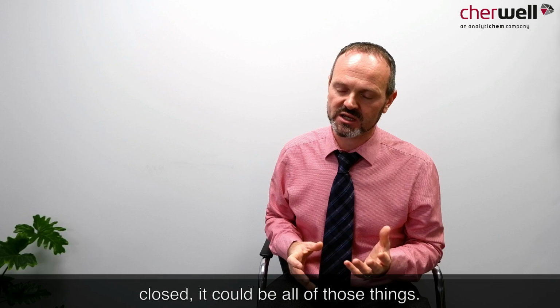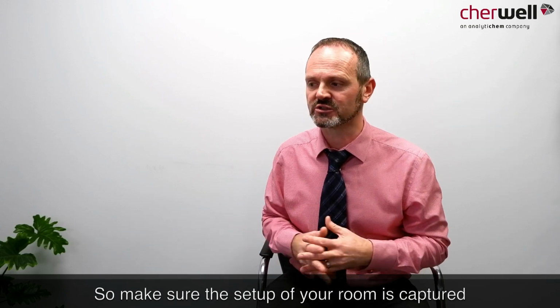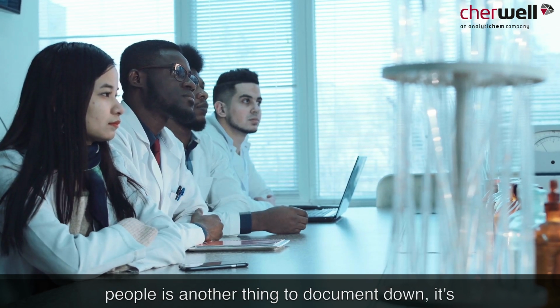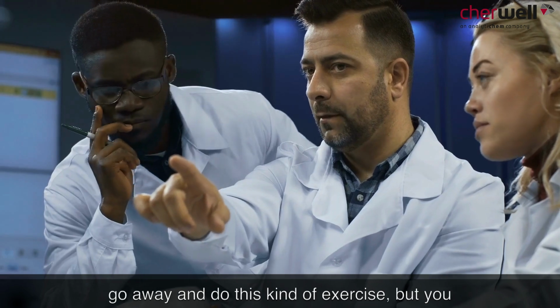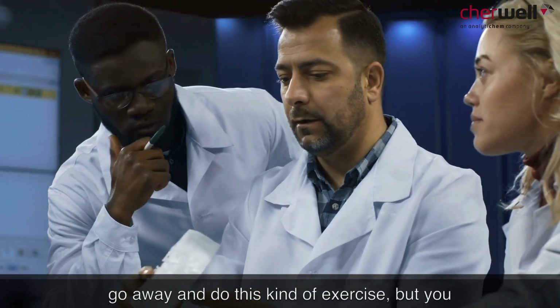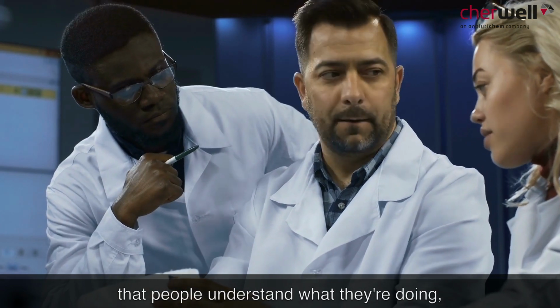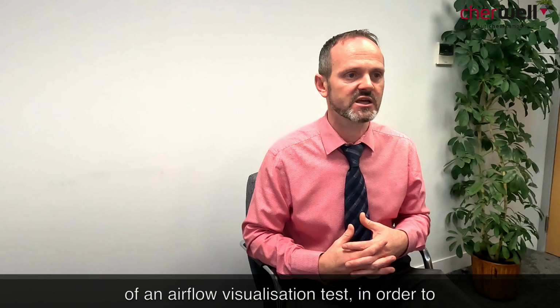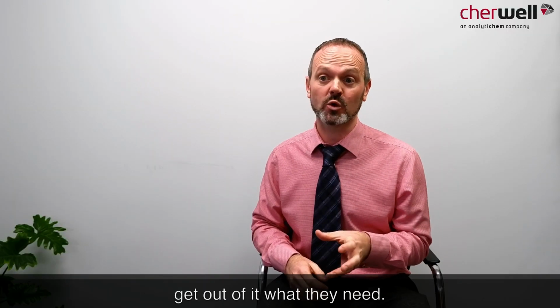It could be all of those things. So make sure the setup of your room is captured in that way. Having appropriately trained people is another thing to document. It's all very well and good letting people go away and do this kind of exercise, but you want to show that there's a training process, that people understand what they're doing and why they're doing it in terms of an airflow visualization test, in order to get out of it what they need.